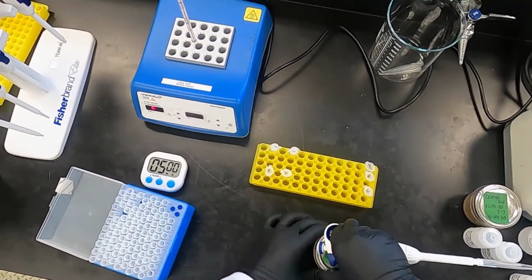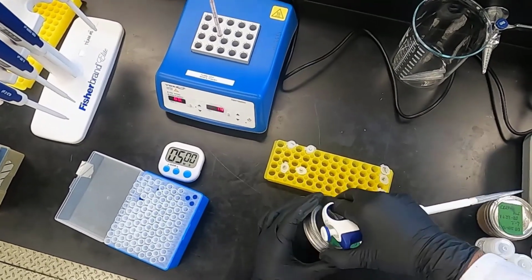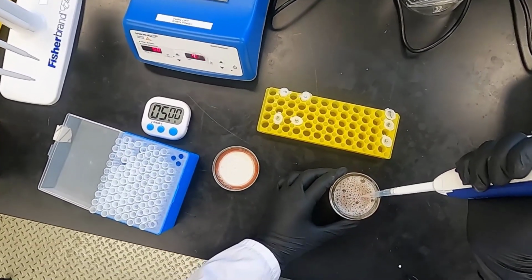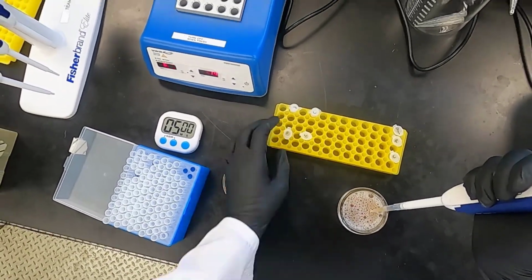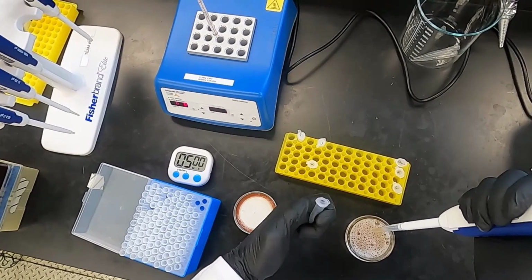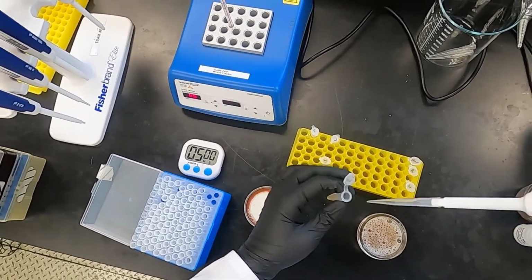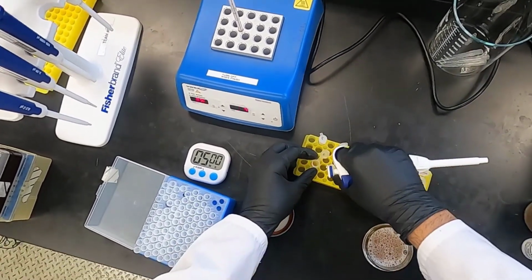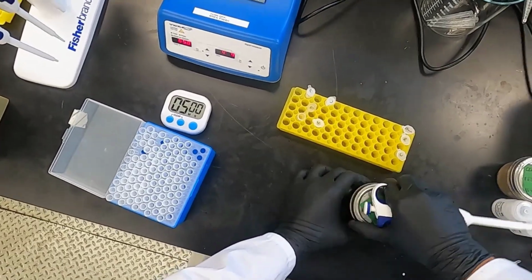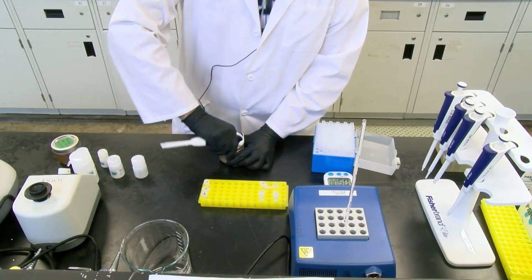It will differ between samples, so consult how much you should add per sample. And now our second sample.